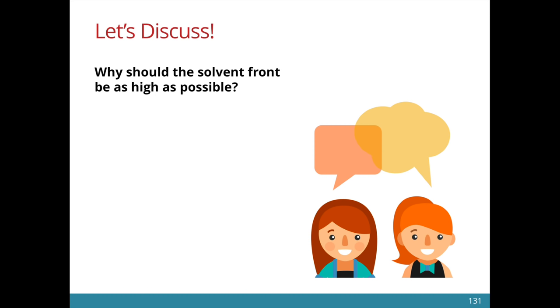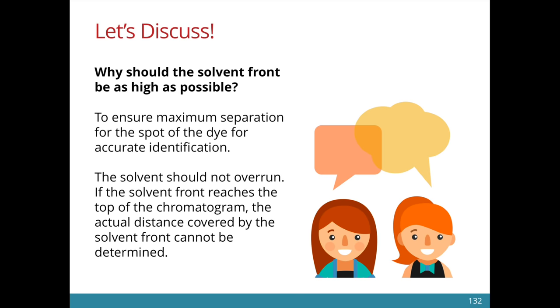Notice that I also let the solvent front run as high as possible before removing the paper. The further the solvent front from the start line, we can ensure a better separation for the spot of the dye for accurate identification. However, we cannot let the solvent front overrun, otherwise we cannot measure the actual distance covered.